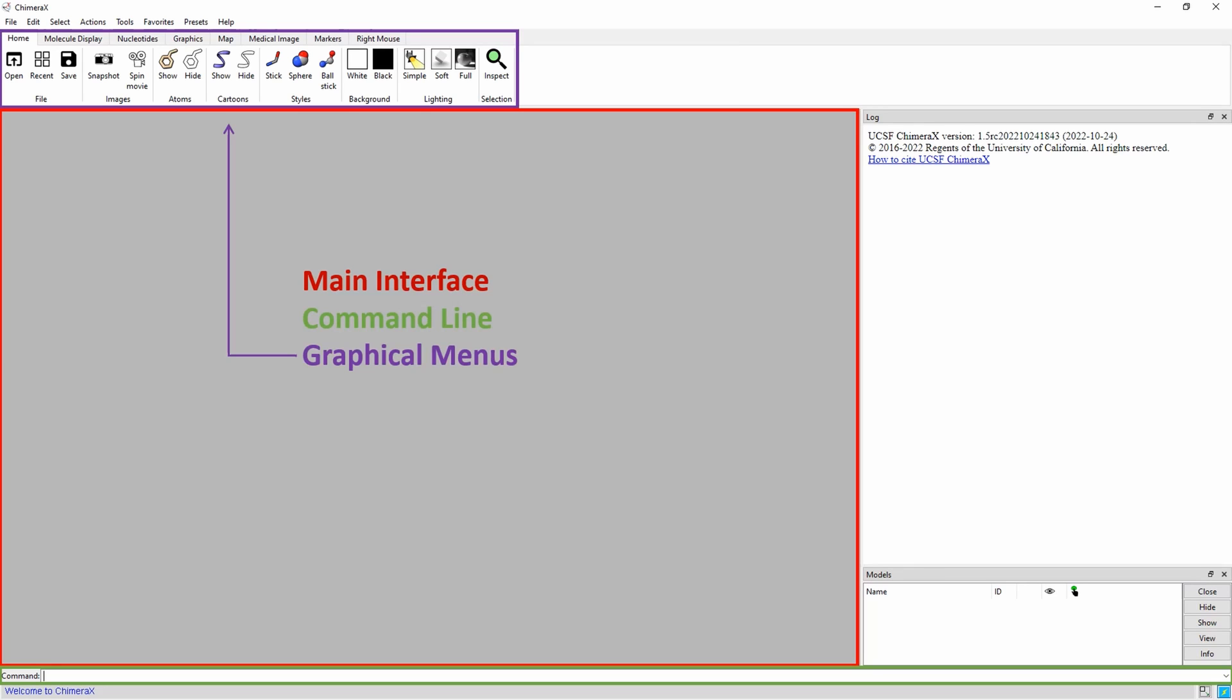The graphical menu, highlighted in purple, contains settings which primarily change how the model is displayed and visualized. Note that on Macs, these menus are not organized in the same way, but still contain the same options.